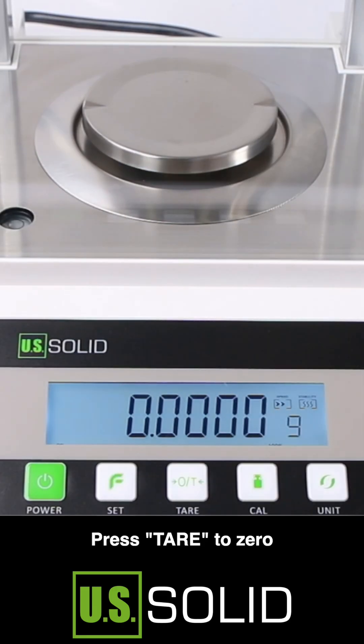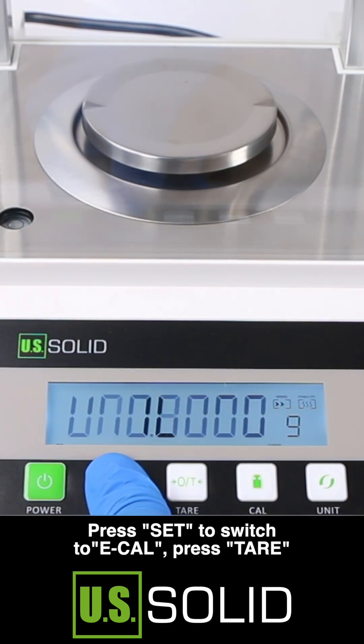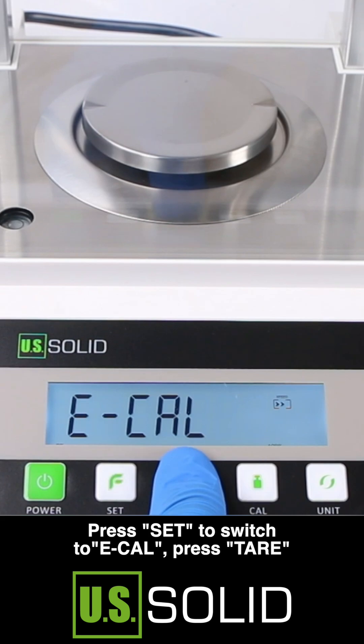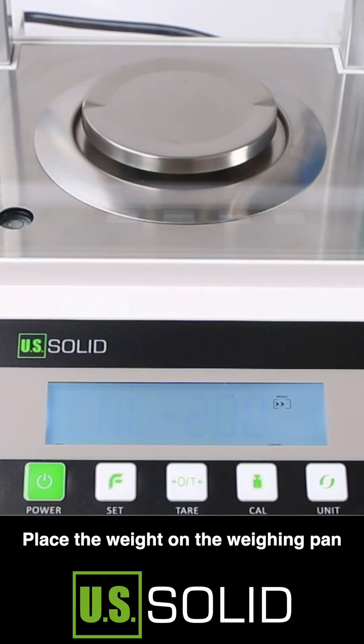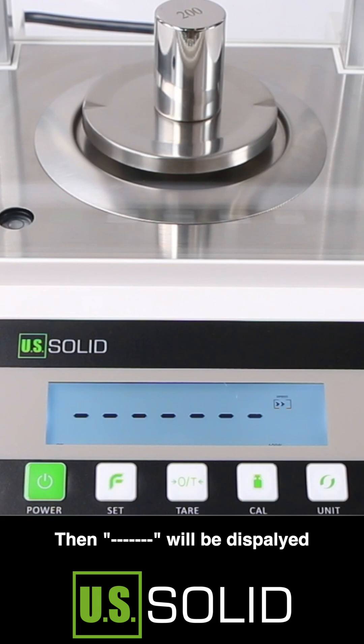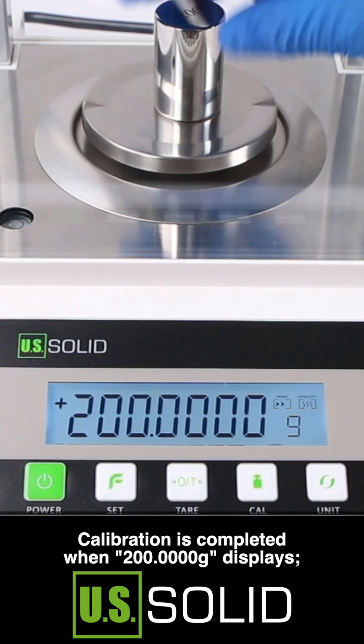Press TAR to zero, then hold SET until a beep sounds. Press SET to switch to e-calibration. Press TAR, then place the weight on the weighing pan. Ellipsis will be displayed, and calibration is completed when 200 grams is shown on the display.